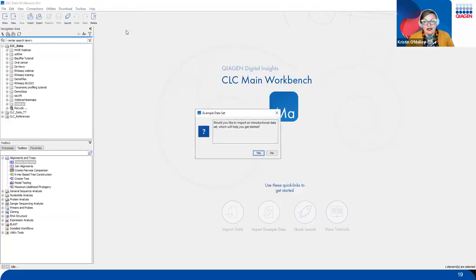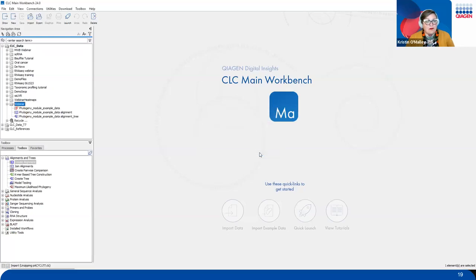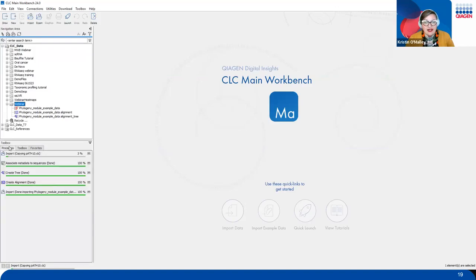So this is really handy data to get you guys used to using some of these tools here. So what I did is I just went ahead and grabbed that data, and you'll see here that it's going to import all of that data into a folder of my choosing. But luckily, I have already done this, so we don't have to wait for this timer to go down here. So let's go and visit that data.